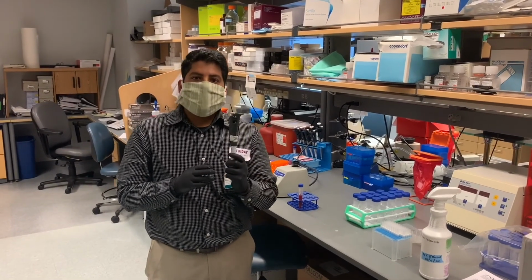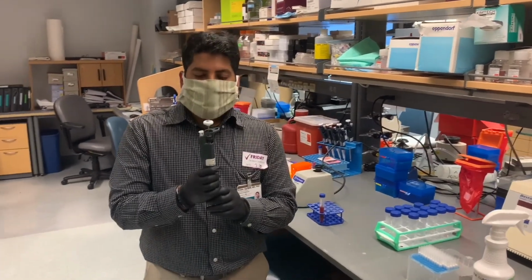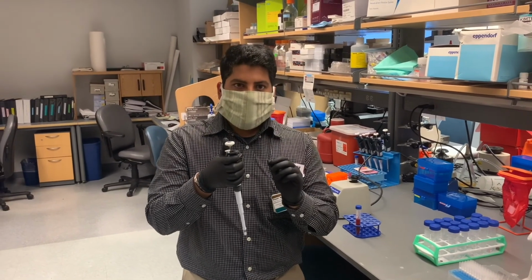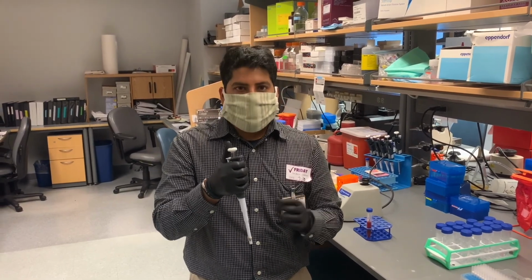One of the most common tools that any biology lab will have is what we call a set of pipettors. What these are is tools that allow us to very, very finely transfer certain volumes of fluid.